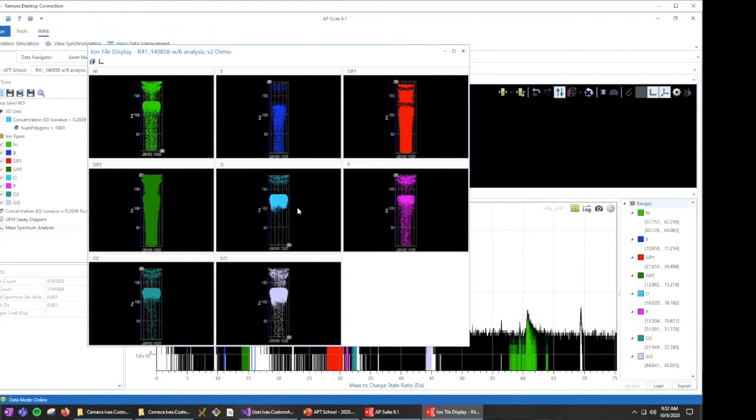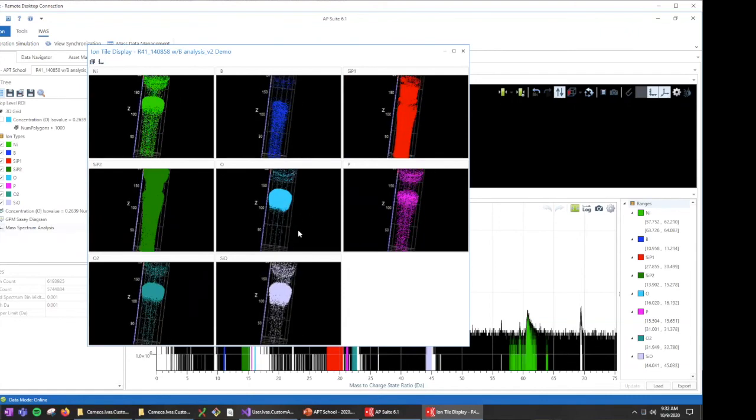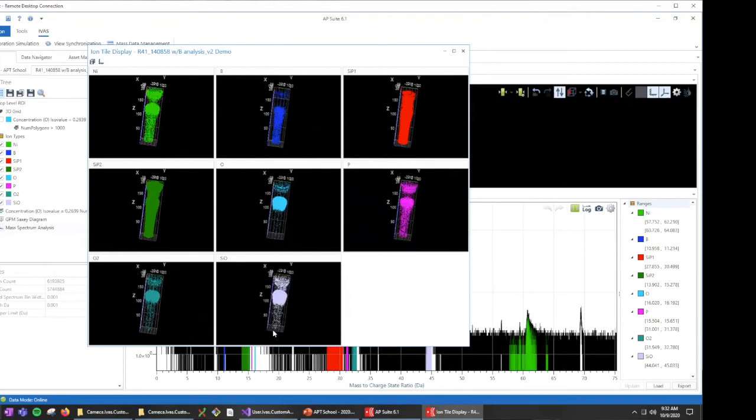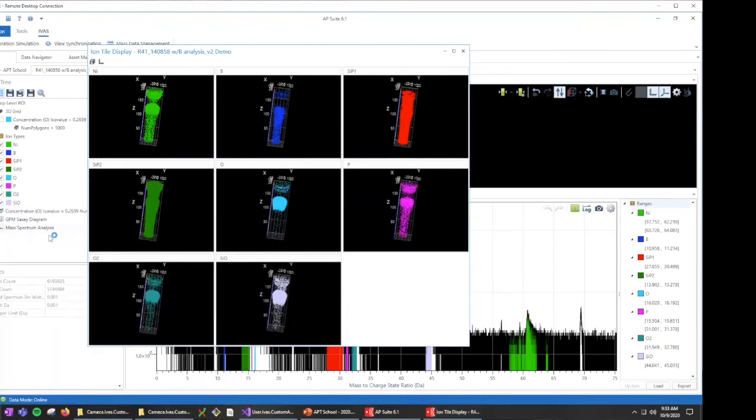Absolutely. It's the same database schema as the old days. It just has a different face on it. So there was a SQL, NoSQL type, right? It's SQL. It's Microsoft SQL. Okay. So if you're curious, I can pull it up.